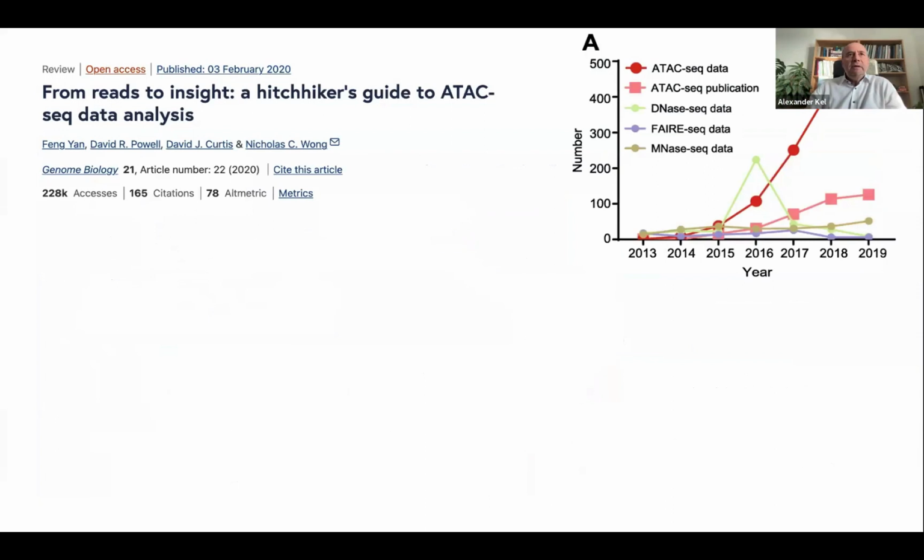And today I will talk about how to use TRANSFAC to analyze this ATAC-seq data, and I would recommend you to read this review about ATAC-seq, the hitchhiking guide of ATAC-seq data analysis. Although it's maybe already 2 years, 3 years old, it's still very good.